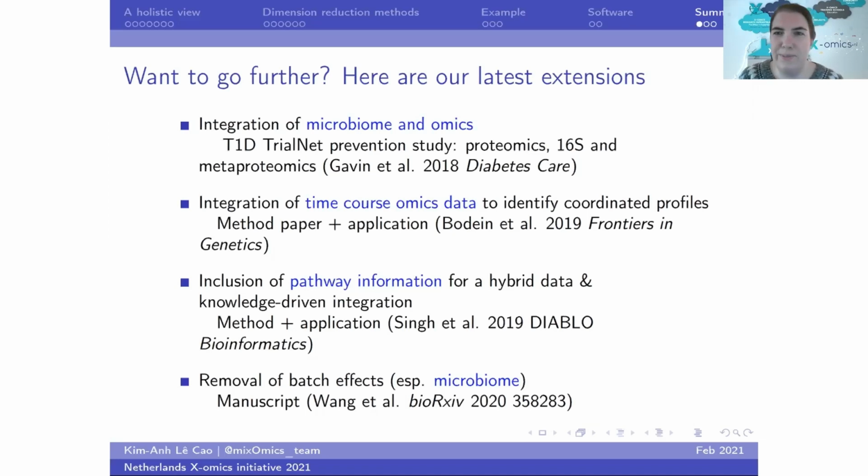Yeah, thanks. And I have another question regarding the supervised analysis. You showed the example of Diablo, that it could be used for supervised analysis with a single outcome variable. Is there a method implemented that would be able to deal with multivariate outcome variables? How would you approach this? So by multivariate outcomes, you mean different vectors? Yeah, if it's a matrix instead of a vector. I'm thinking of readouts of variables or extensive phenotype information or exposure information.